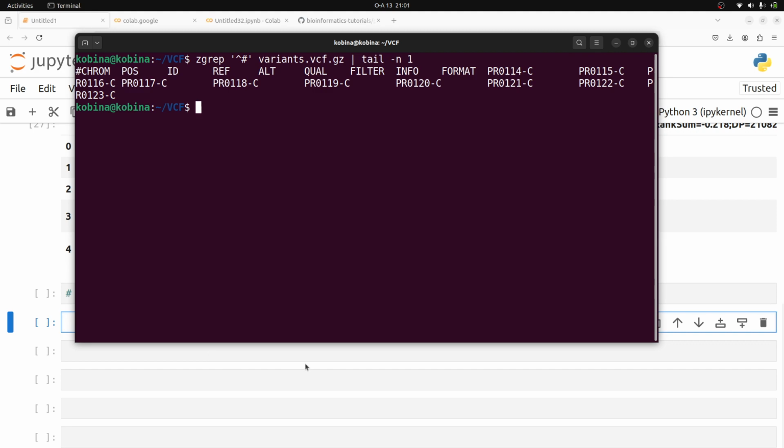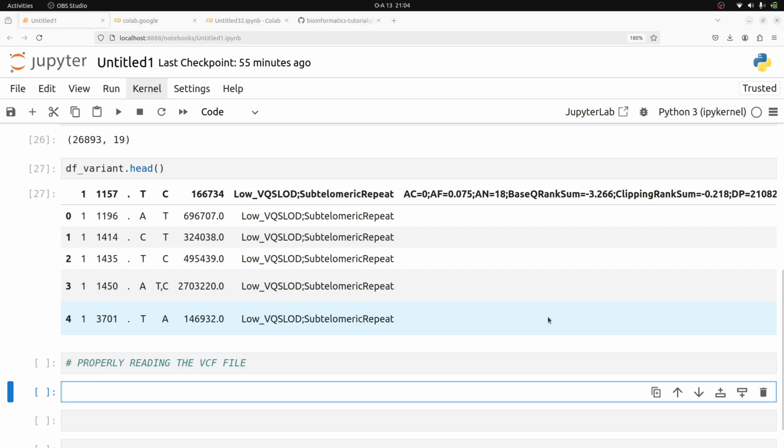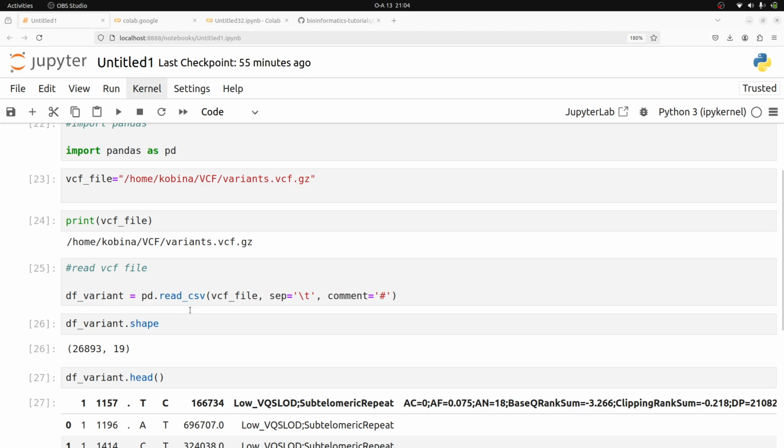There's a Linux command. So if you're using Windows, it may or may not work. I've not really tested it on a Windows environment. I mostly deal with Linux, but if you're using Google Colab, chances are it's going to work as well. So don't worry if you don't have a Linux machine, at least knowing the rationale will help you use other tools to get that. So we are going to issue our command to get the headers, and then add it to our Pandas data frame.